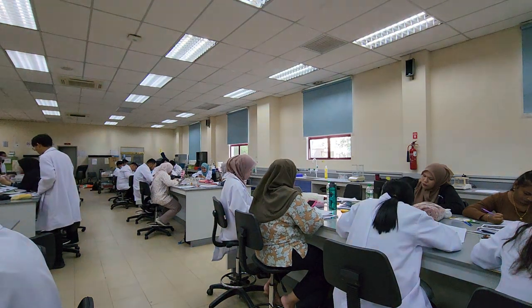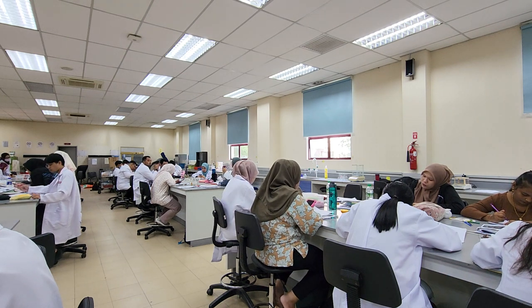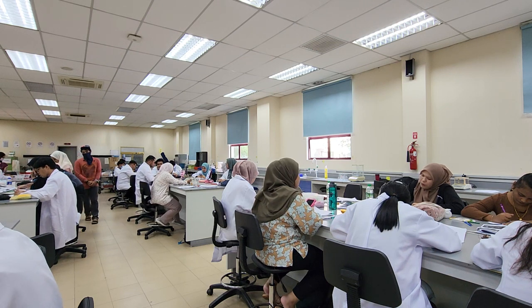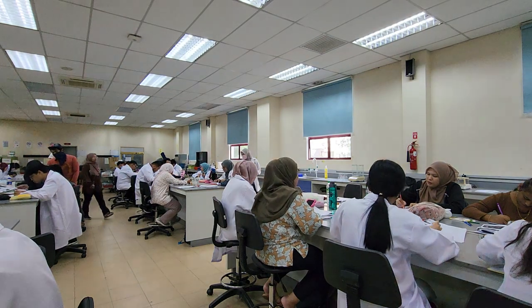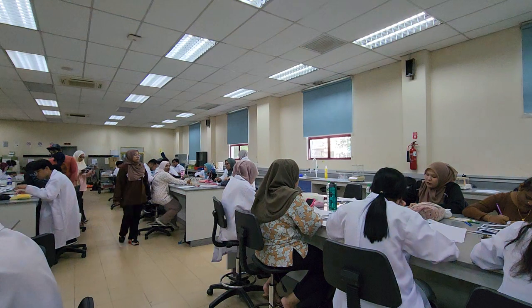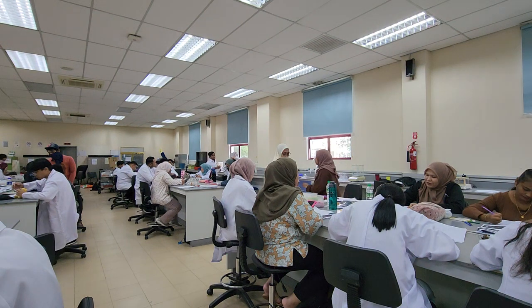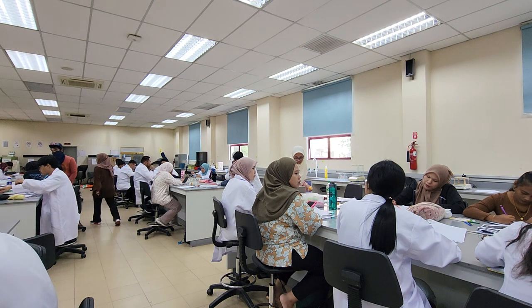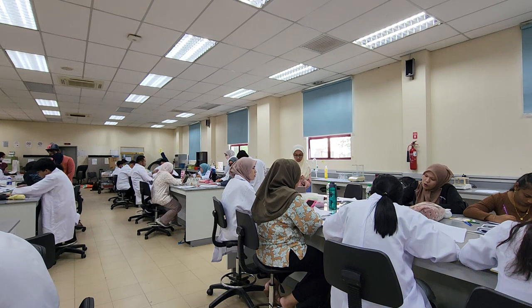Doktor, kalau tu yang macam tu, kalau padi tu yang lemah padi tu kena lukis tu. Ya. Itu kan buah dia. Apa? Placentation dia. Cuba tengok. Sekarang ni yang kau lukis ni kat mana? Kat mana dia punya ovule? Ovule. Situ. Okay. Yang mana paling dekat?